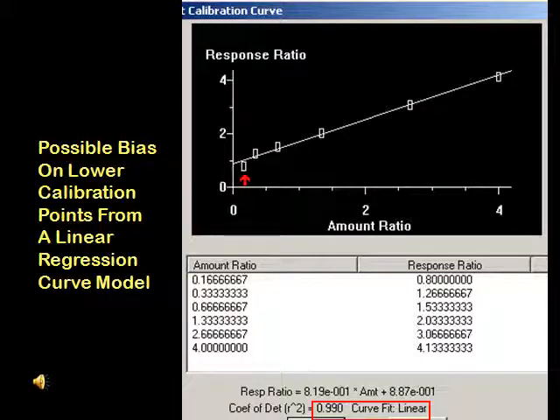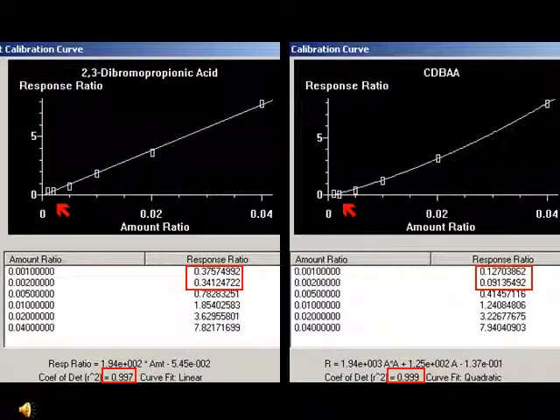This model, because of the higher weighting associated with the higher standards, may have lower calibration standards that are not well represented, but will still pass a method criteria as was demonstrated under the linear regression least square calibration model discussion. In the first example, which is also discussed under the detector sensitivity section, a linear regression curve was used for the EPA Method 552 analysis.